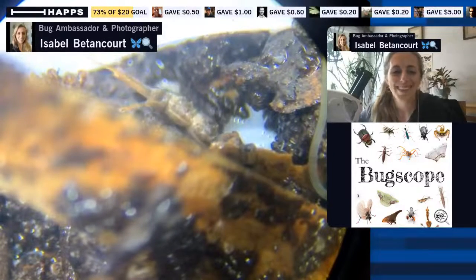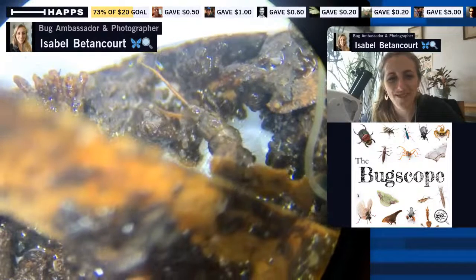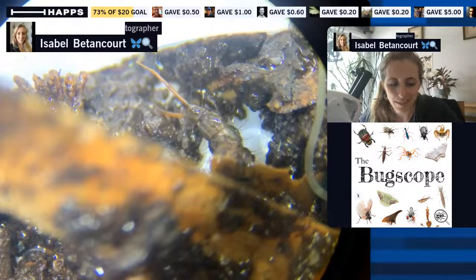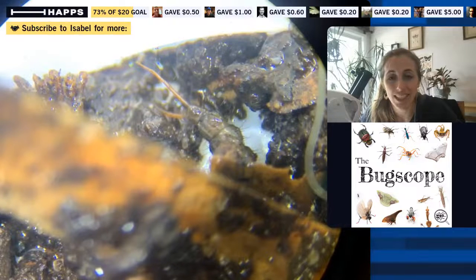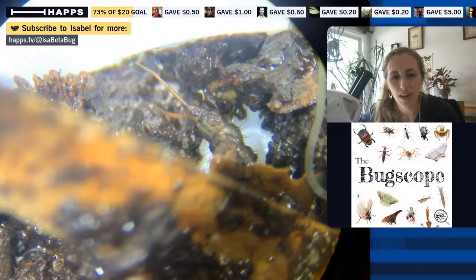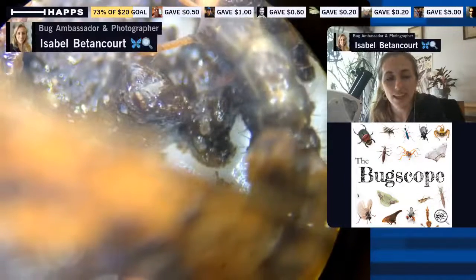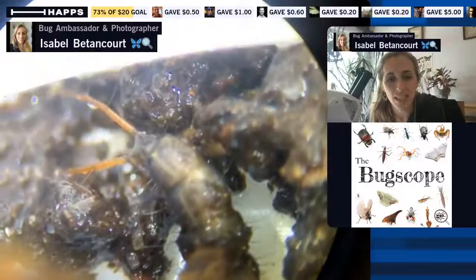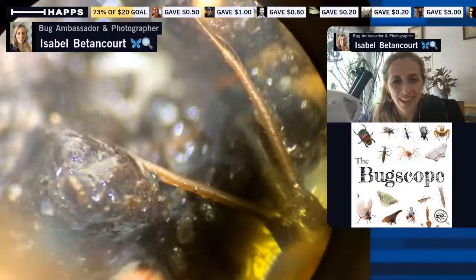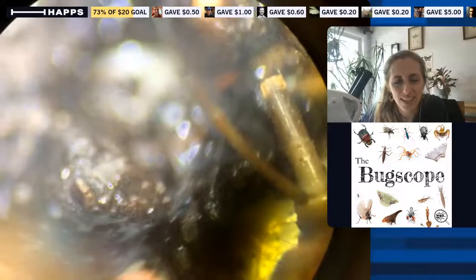It's moving around so much it's hard to keep in frame. This is why it's so helpful to have pinned entomology specimens and insect collections — that really enables us to take a closer look without worrying about them running around. It preserves them for years and years, so someone can study it this year and then another scientist can study it 50 years from now, when we have more information.